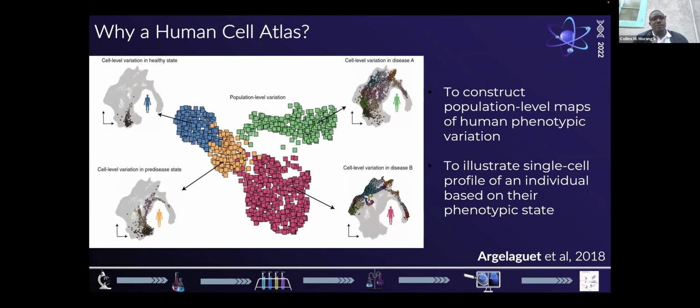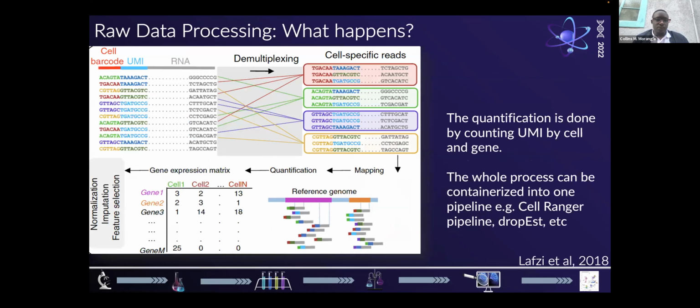So basically, this is what we use. We try to form clusters from the single cell data so that we can see our cells separating according to a particular phenotype, and what could be the particular phenotype or particular different cell type. So this is basically what we do.